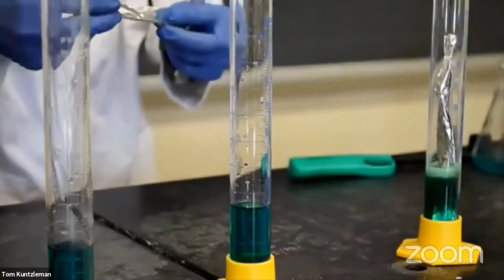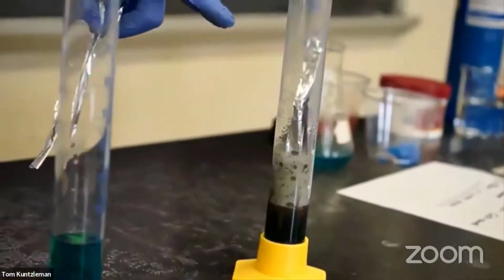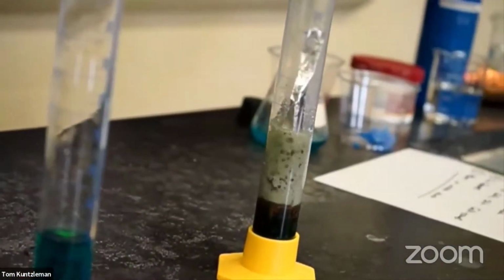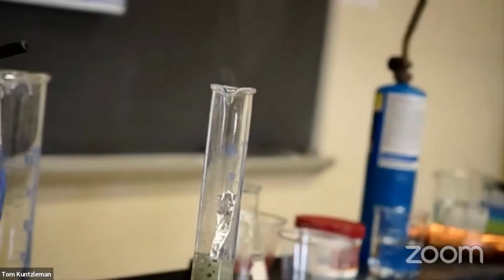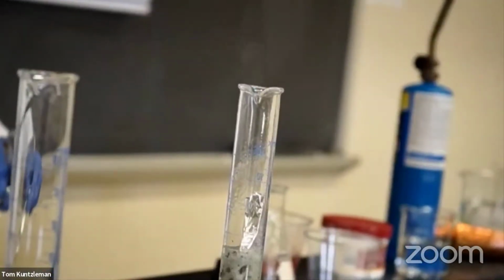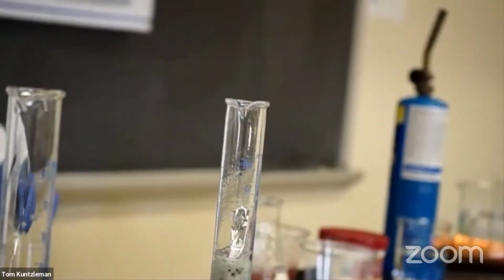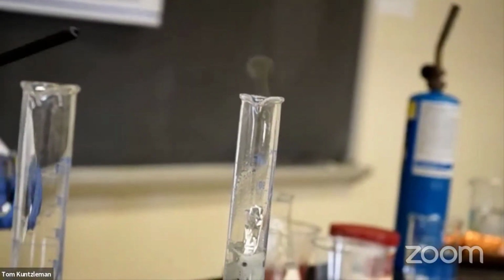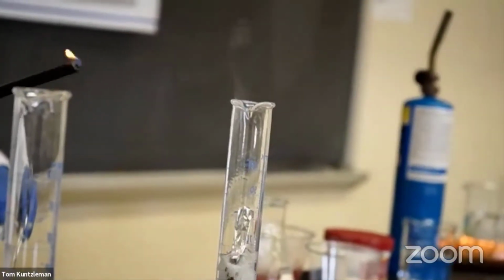Oh man, look at that. What's going on there? Hey, wait a minute. I wonder if there's little particles of copper being emitted. Let's find out. Oh, you see that? What color was that flame? You notice the color of that flame? Gotta watch carefully. I don't know about you, but I'm seeing a green flame. Beautiful.